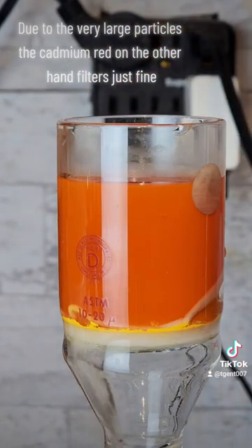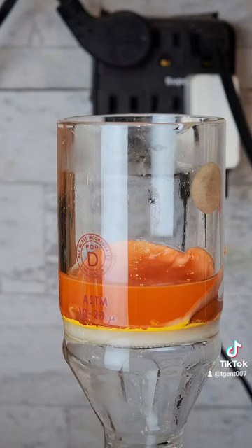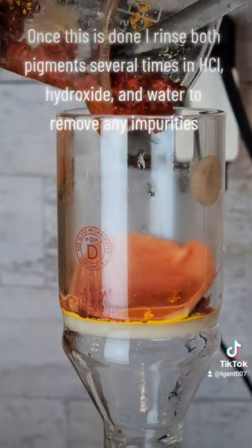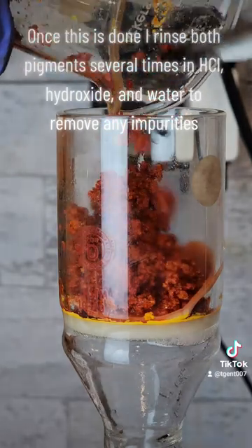Due to the very large particles, the cadmium red, on the other hand, filters just fine. Once this is done, I rinse both pigments several times in HCl, hydroxide, and water to remove any impurities.